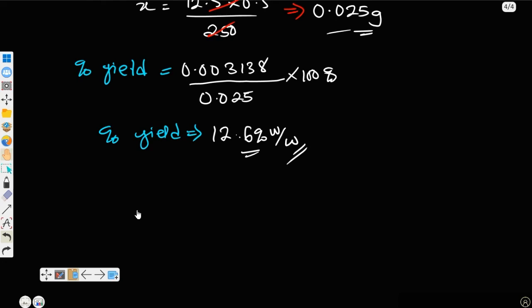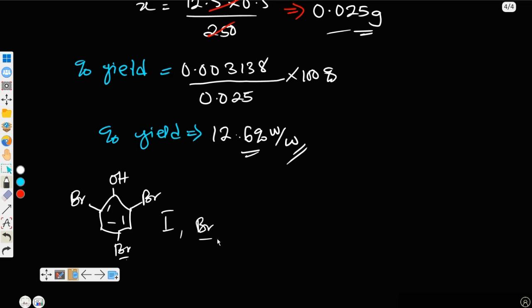Now they may ask, in the assay of phenol, why do we add chloroform? We add chloroform to dissolve tribromophenol. You added chloroform to dissolve the tribromophenol form, so that no iodine or bromine, since that reaction involved iodine, is adhered to the precipitate, because it's going to precipitate this 2,4,6-tribromophenol. When you add chloroform, it is just like a crystallizing agent. Are you getting it now?